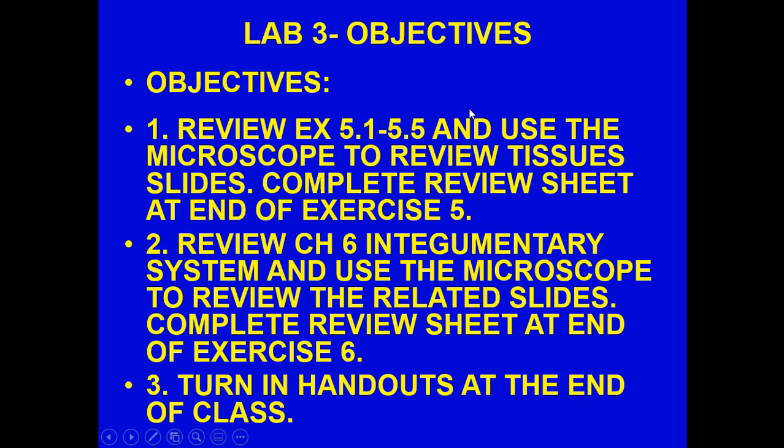The objectives are to review the exercises in 5.1 to 5.5 and use the microscope to review tissues and tissue slides. If you don't have the capability of doing that, such as it's an online course, no problem. Review the sheets for each of the exercises, then review the videos. I've selected videos that put emphasis on making discernments of what the structures are at the microscopic level, and you'll see actual tissue slides, and they'll help you to understand the structure as well as the function.